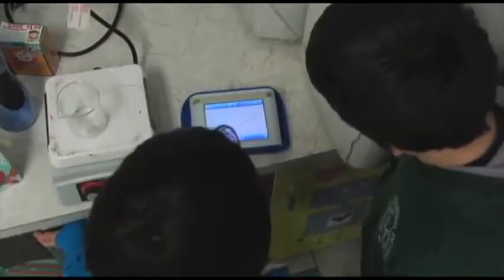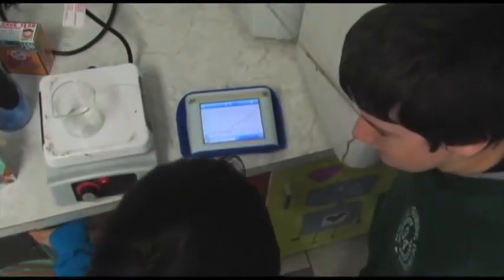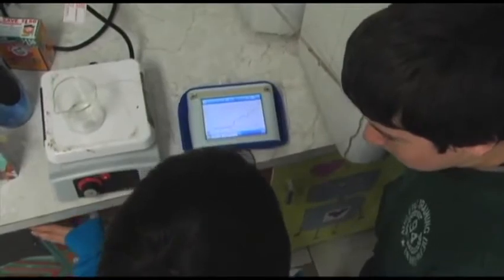It's going to stay at 0 for a long time until it melts. It can't be over 100. 100 is the evaporation point.